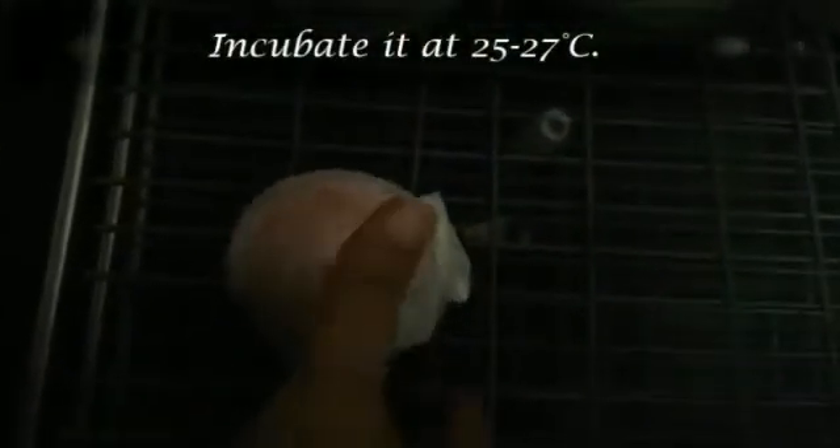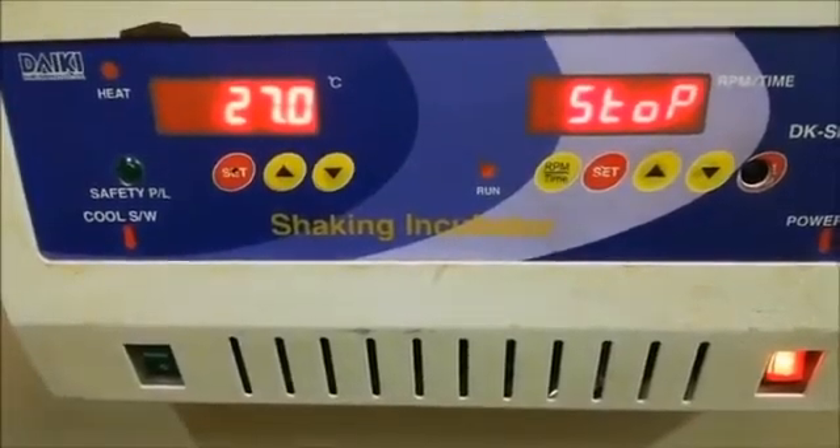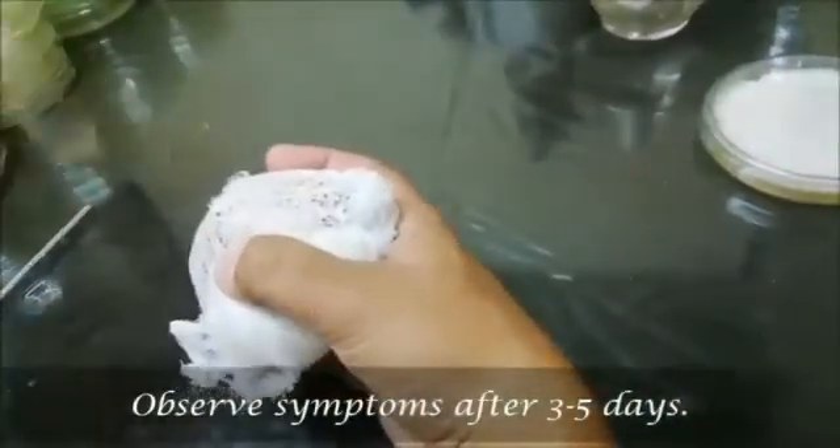Incubate it at 25 to 27 degrees centigrade. Observe the symptoms after 3 to 5 days.